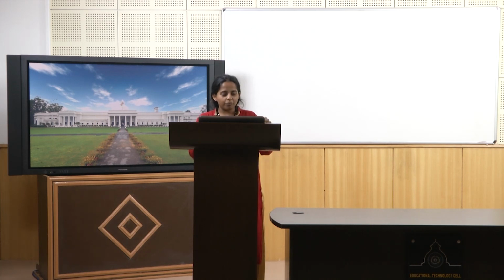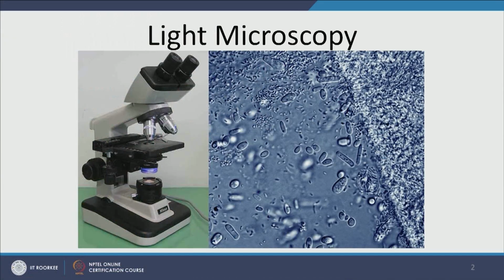One of the most influential microscopic methods today is light microscopy. This is something that you are probably familiar with from your high school biology class. This is a microscope that shines light on the sample and has a decent magnification where you can definitely see eukaryotic cells in all their glory, and prokaryotic cells swimming around. Simple as its structure is, and despite its commonness, the light microscope is still used in many high-end microbial laboratories for the simple reason that it is still very useful for observing cell activity.